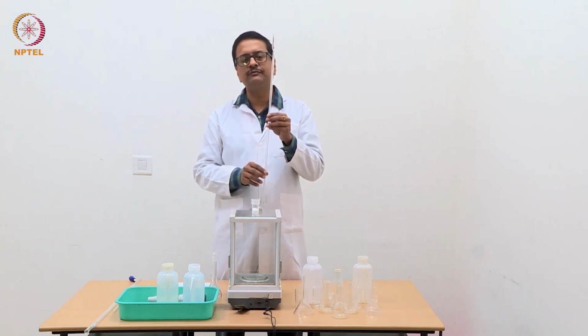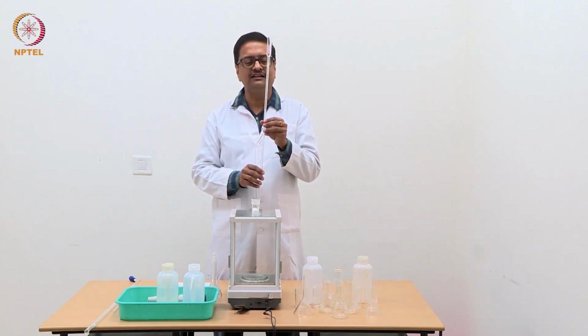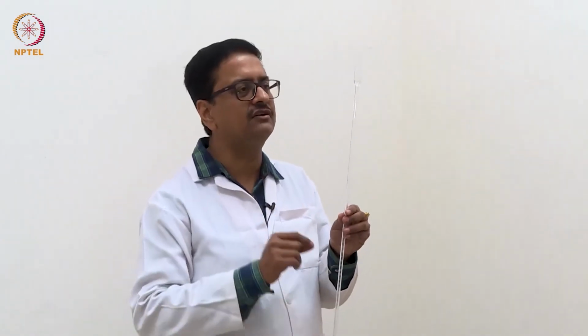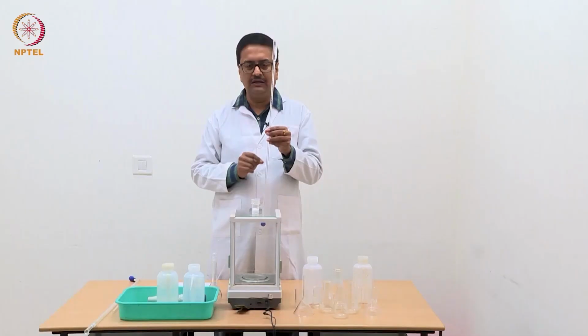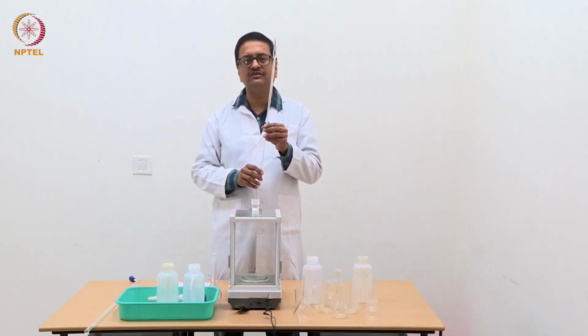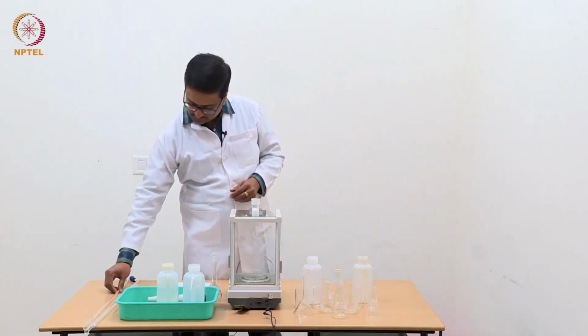This is a very precise burette which we will be using for all our potentiometric and conductometric titration experiments. Why is that? Because we need the reading of the pH or conductance value after a very small addition of the titrant liquid, which may be sodium hydroxide or silver nitrate solution.